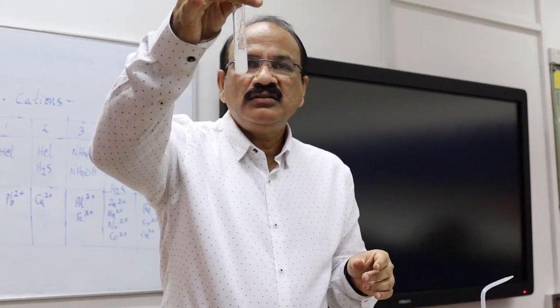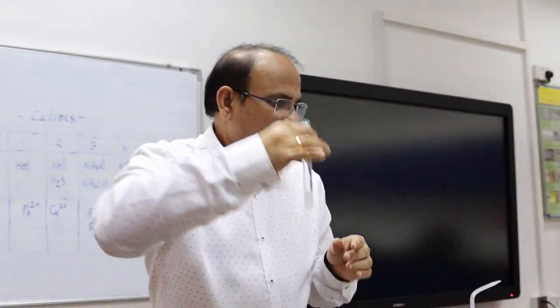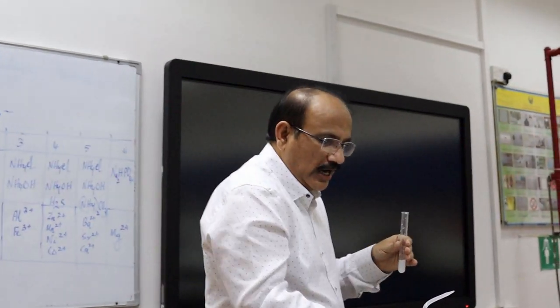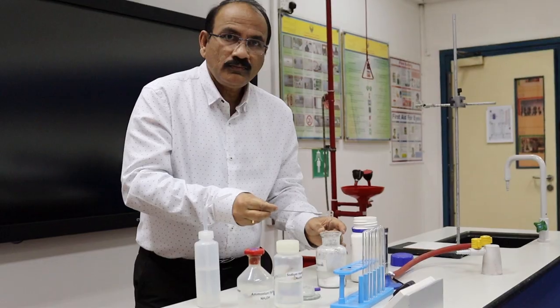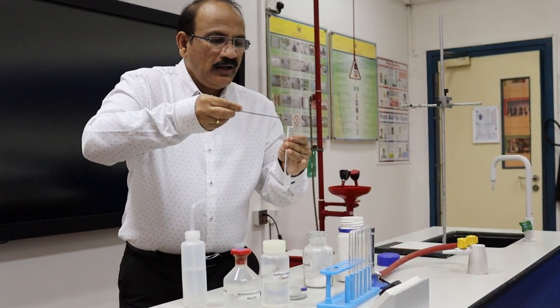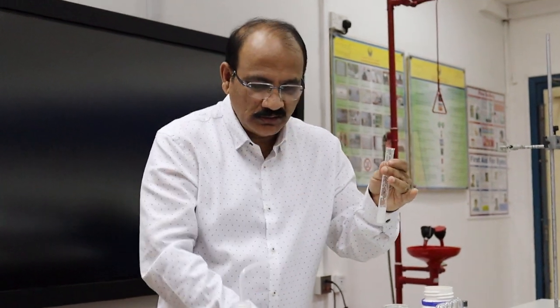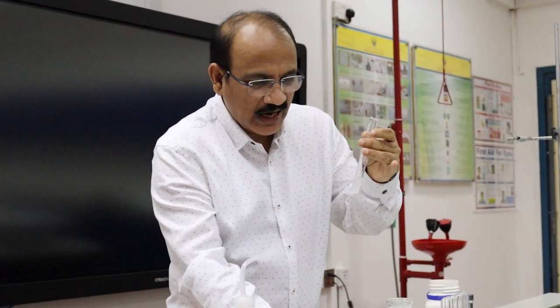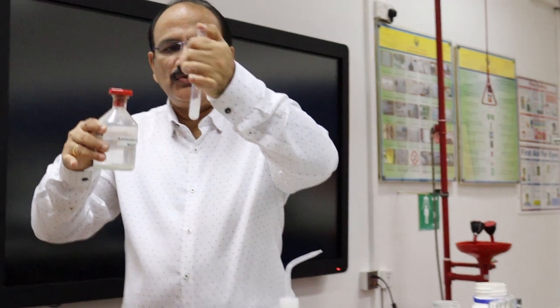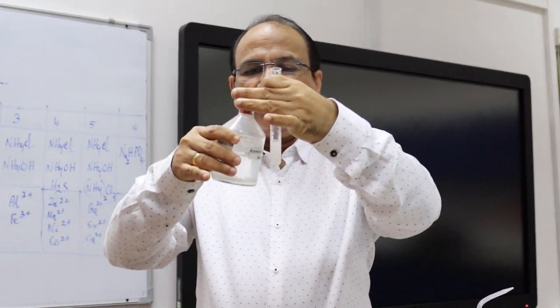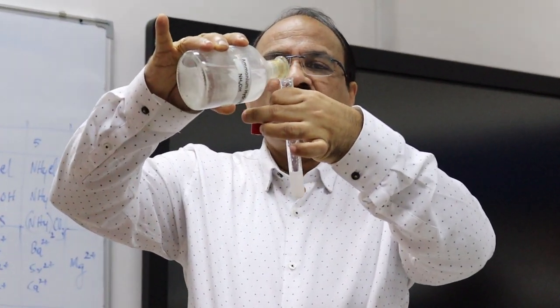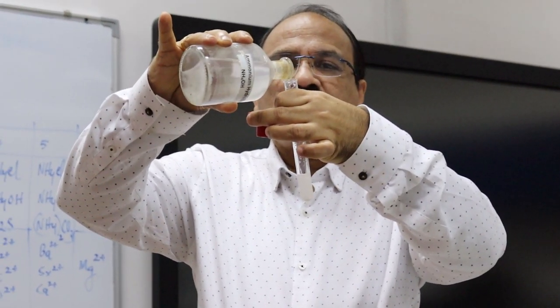Into that, we will add ammonium chloride and ammonium hydroxide. I am adding ammonium chloride into that and gradually I will add ammonium hydroxide into this solution.